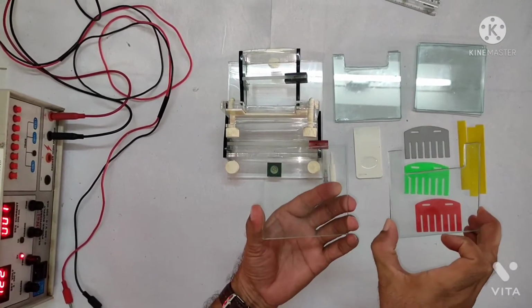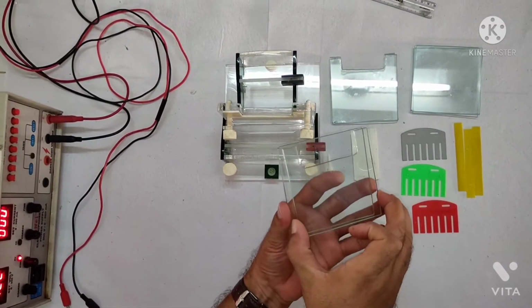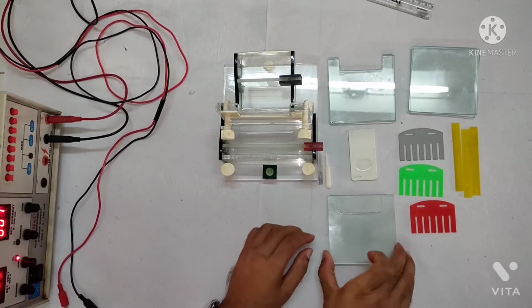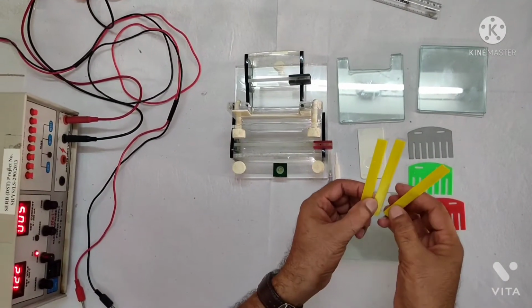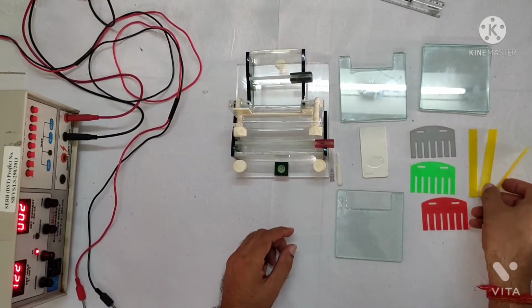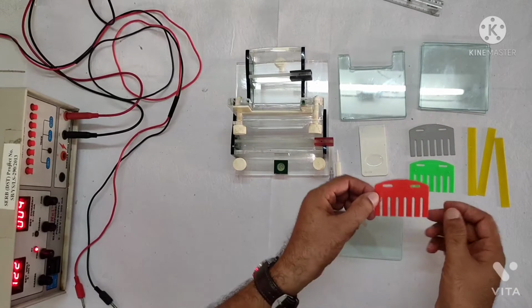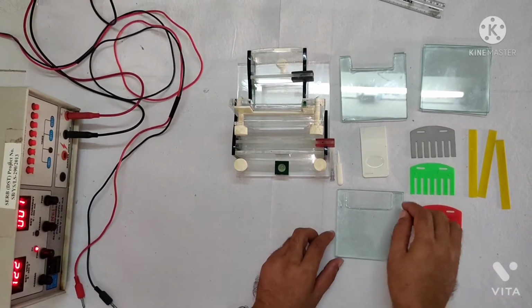Okay, so these are the casting plates. This is the complete plate, this is the notched plate, right? We set them like this, and then we put spacers in between the plates, right? So these are the spacers, 3 spacers we put here in between the plates during the casting of the gel. Okay, and this is the comb. We put the comb here in the notched part of the plates.